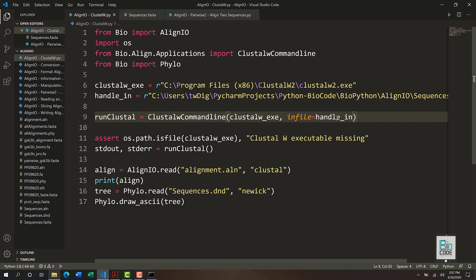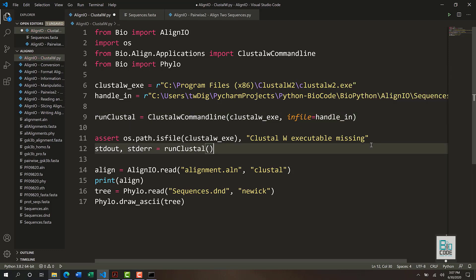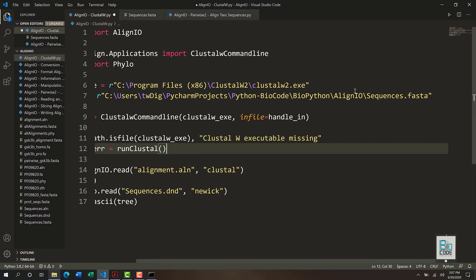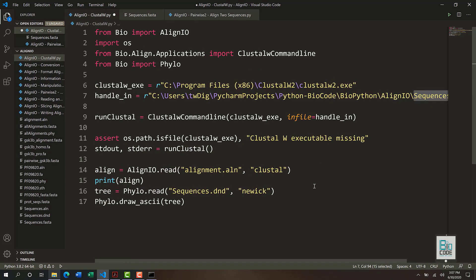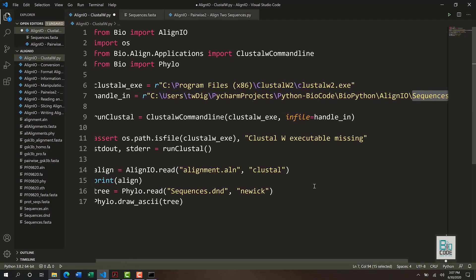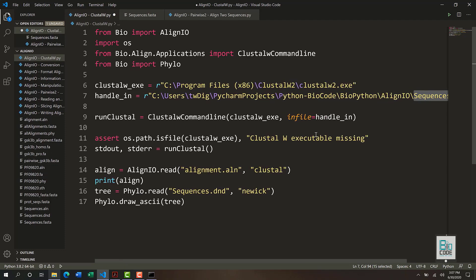There is another argument you can pass in, which is outfile, if you would like to specifically name your alignment output file. In most cases you don't need to do that, because ClustalW will automatically create a file according to the name you provided as input — so sequence.fasta will be converted into sequence.aln. It will not override the original file.